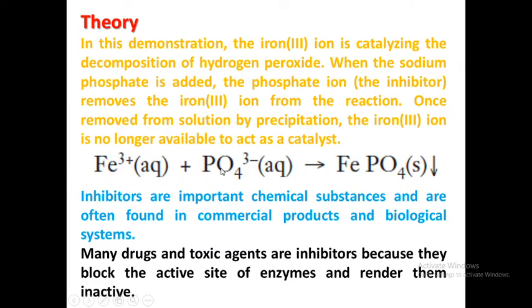Iron plus phosphate equals iron phosphate.